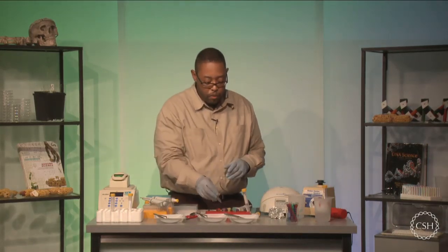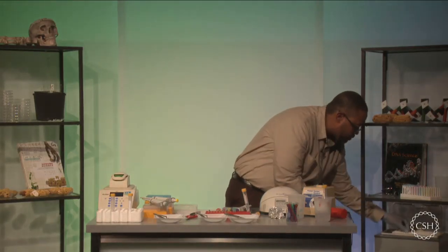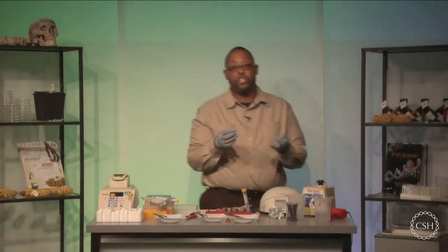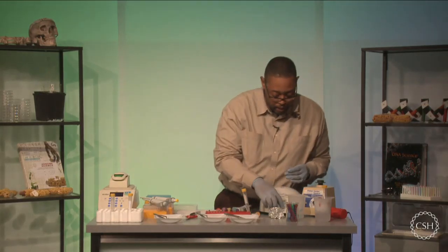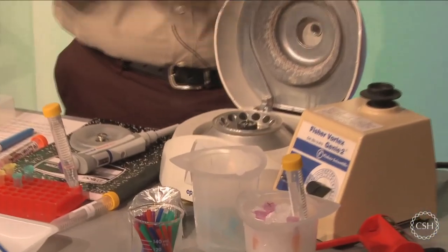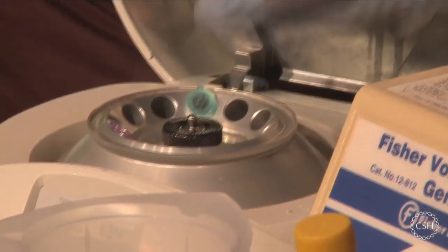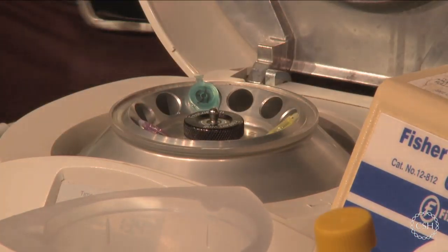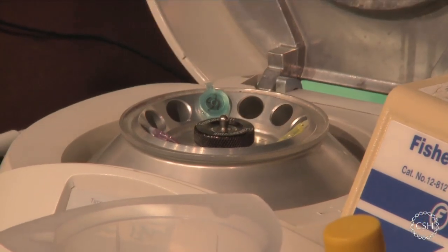Okay. So after we incubate for about 10 minutes, we will take our samples out. And at this point, all of the tissue should be essentially broken up and has released a lot of the DNA into the solution. So what we're going to do is open up our microfuge, and we're going to place our test tubes in a balanced configuration. Now, what I'm going to do here is make sure I'm placing my test tubes in an orientation to where the hinges are pointing outward. So I'm going to make sure that this hinge is pointing outward towards me.